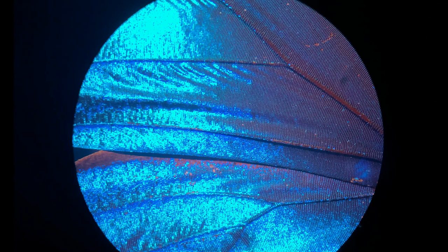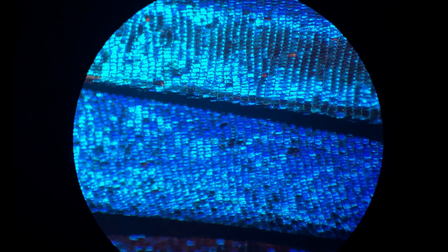Ooh. Very cool. Definitely like a sequin dress fabric or something like that. On the compound.